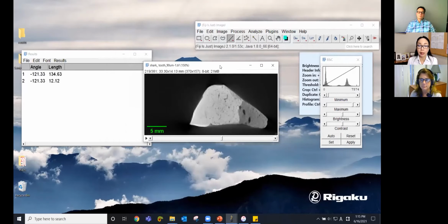Right. The last thing I wanted to show you as one of the basic things you probably want to do is saving the results. So we reduced the file size and added the scale bar. So you might want to save this file as a new TIFF stack.